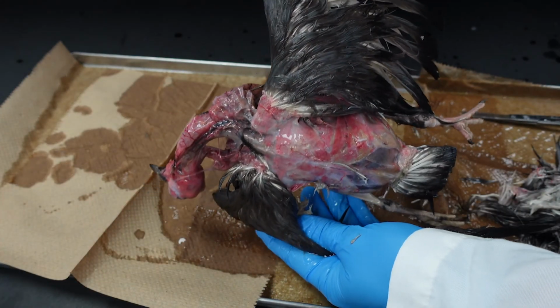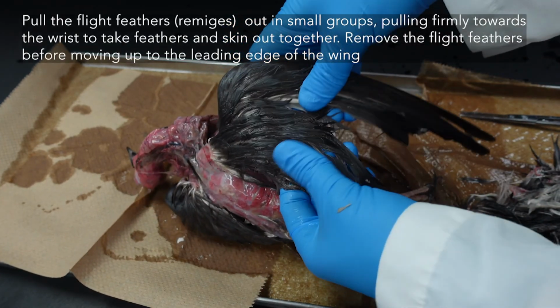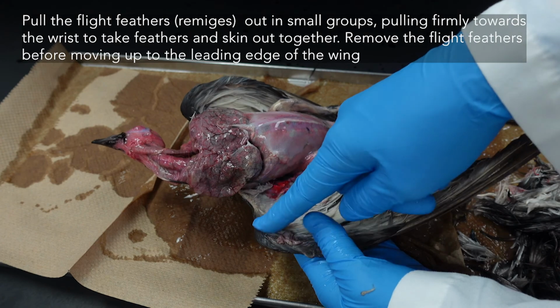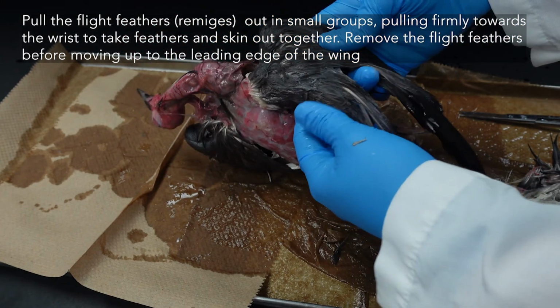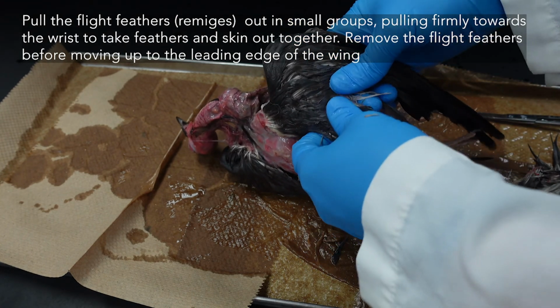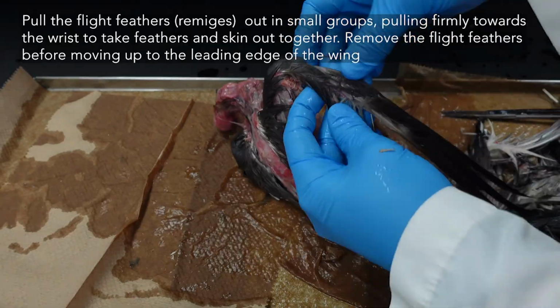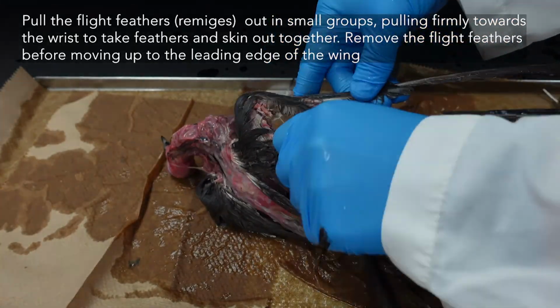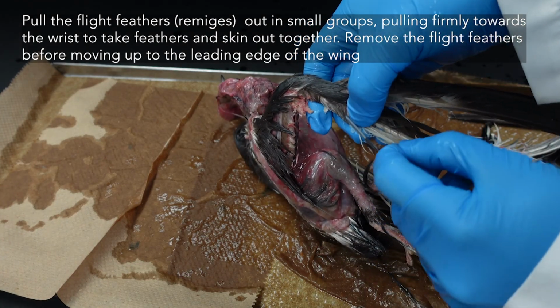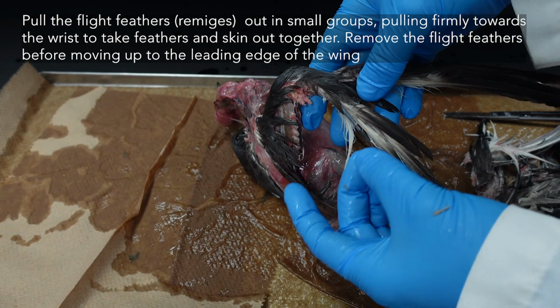Looking at the wings of the bird, you have the long flight feathers, so you want to actually take those flight feathers off. And they will pull most of the skin with it, so then you're just looking at the underlying forearm. So grab small groups of feathers and pull them either towards the wrist or towards the elbow. If you see a feather that's kind of like a little tube with a feather sticking out the top, that's a feather that's currently growing, so this feather was being replaced.